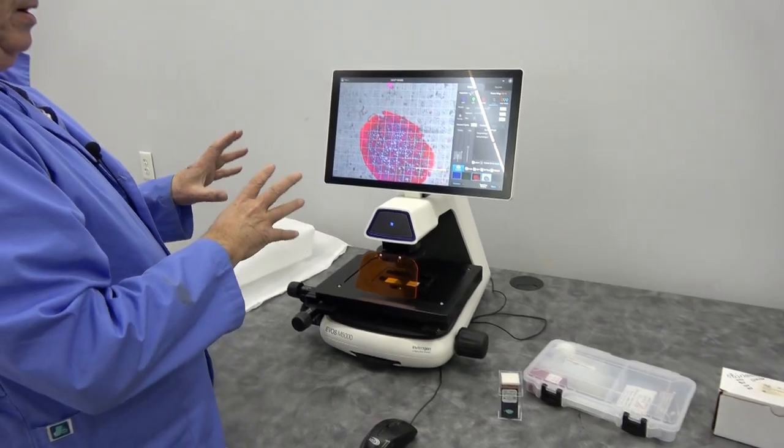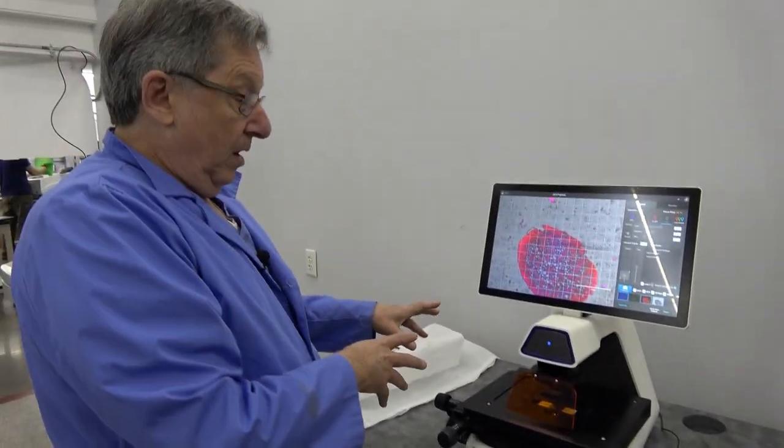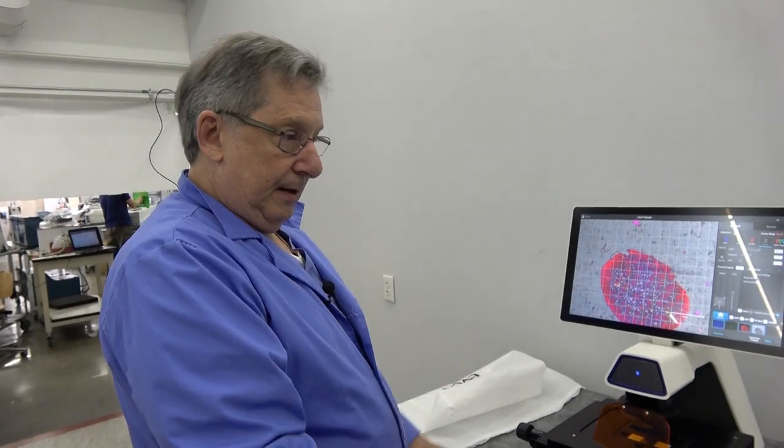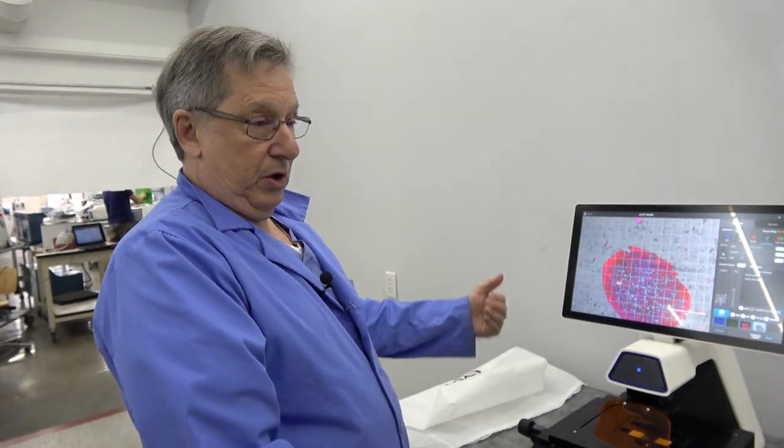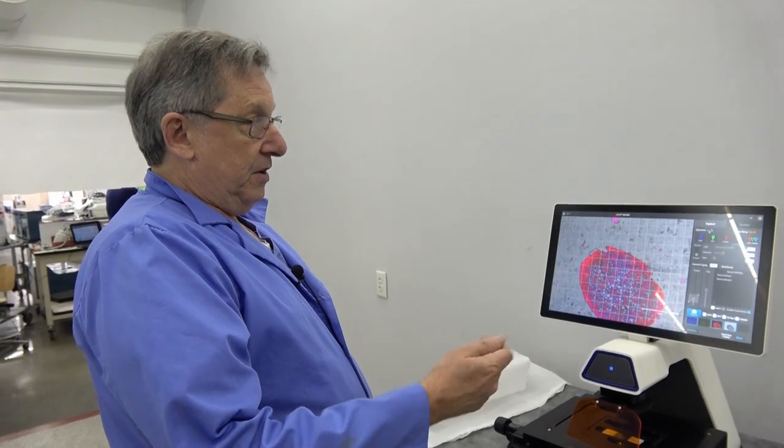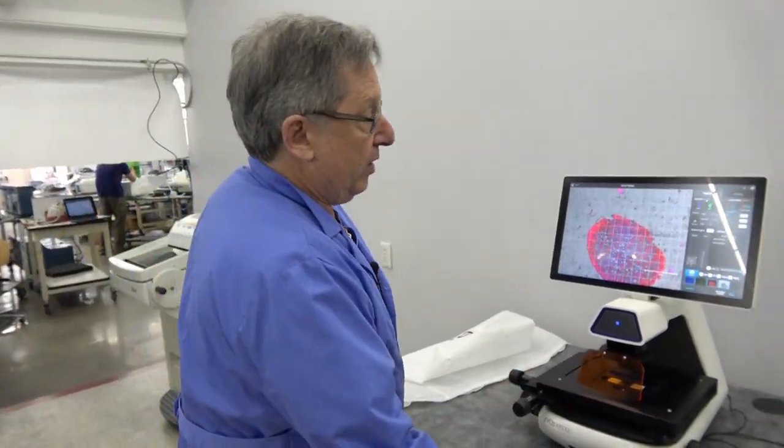This is set up wirelessly using a standard USB wireless adapter, although you can hook it up to wired. It supports USB, so you can dump your files out very quickly.